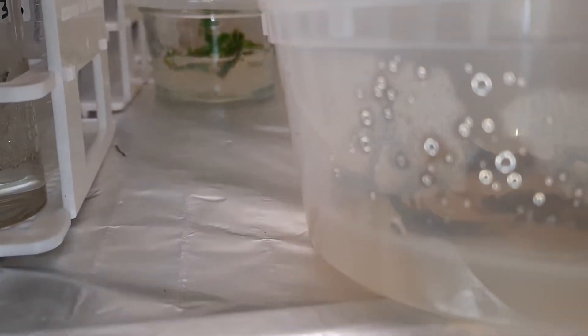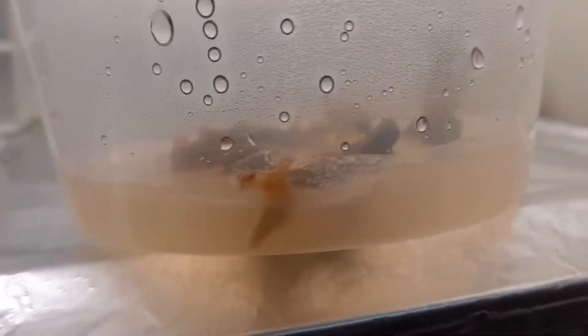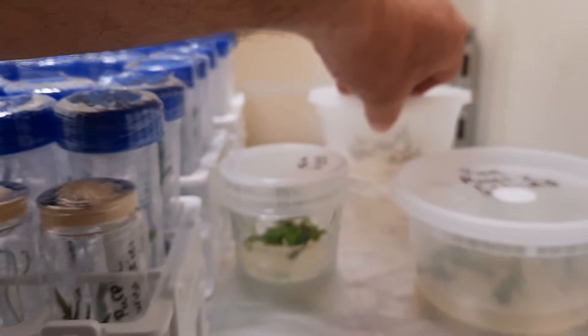I've got one back here — the first divine bananas — and they're not doing so hot. In fact, they look like they all died: all brown, all except for that one back there, and it's mostly brown too. I forgot to check the pH in this media — if I remember right it was supposed to be automatically set, but I bought it as part of a kit, so I don't know.